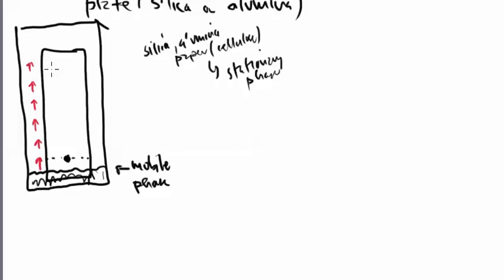And then we know that the TLC plate has finally developed because we can see the solvent line. And the solvent line might approach up near the top. That's preferably where we would like to see it. And we would pull out the TLC plate at this moment in time. So the solvent line, once it approaches the top of the TLC plate, you will then grab the TLC plate and remove it from the beaker that has this mobile phase in it.